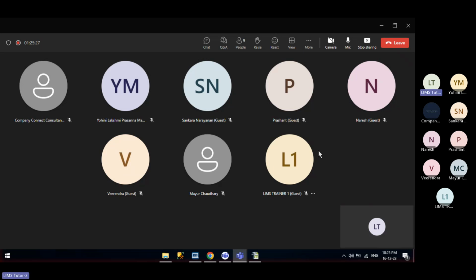The same product will have multiple phases, country-wise or, rather, market-wise stages available. Like for the US market, it will be different. For the domestic market, it will be different. If it is the domestic market, the list of analysis may vary compared to the same product marketed in the US. So how is this configured?